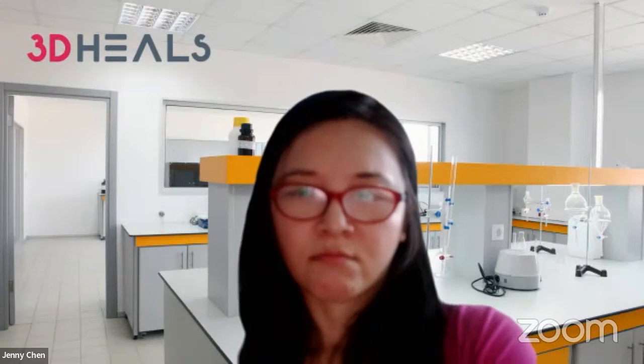Okay, great. Amira asked, can you print in a way to show laminar organization of... I'm not sure, let me see. I'm going to read the original question because I feel like there may be a typo. Can you print a way to show the laminar organization of the brain cortical structure?